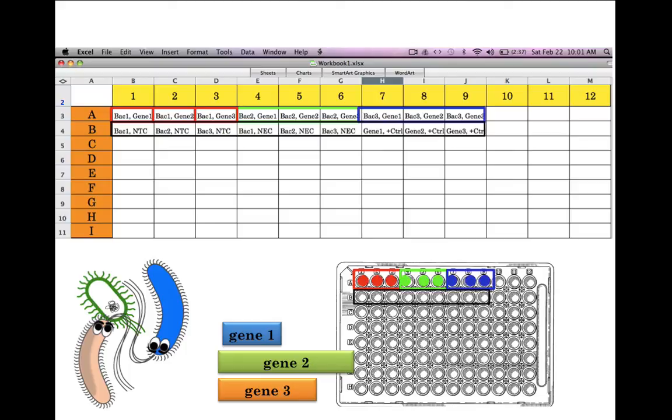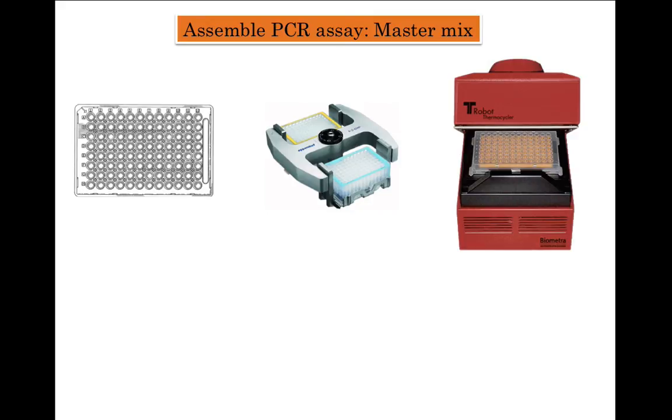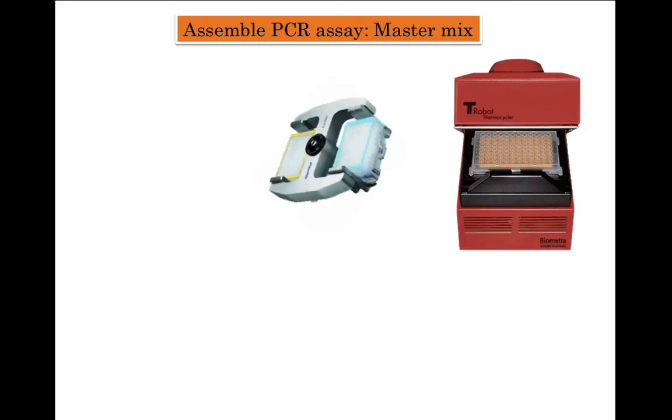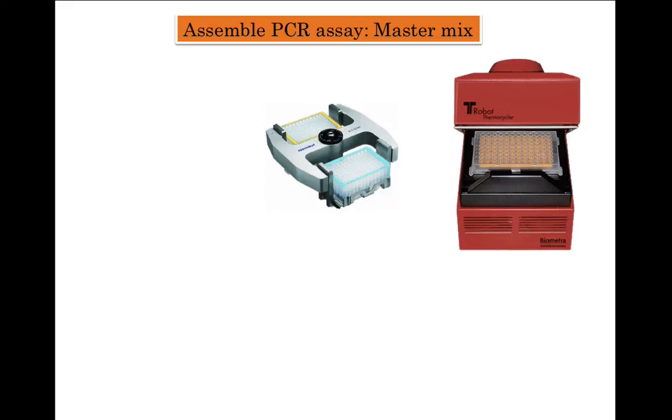especially if the experiments are more intensive. Once you prepare your entire plate, you spin it down. Just give a brief spin so that all the components are mixed nicely, and then you simply put it in your thermocycler. If you don't have that many wells, like here we are actually using just 18 wells, you don't want to waste a 96 well plate.